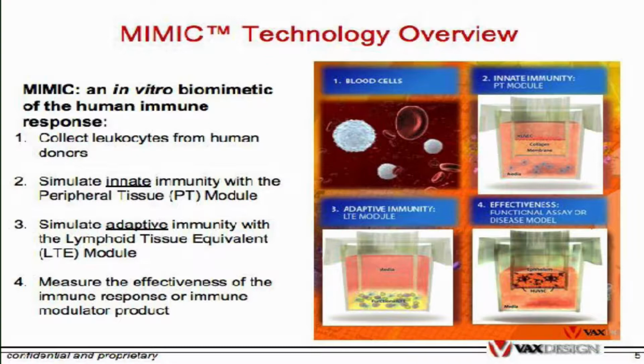We don't give them tea and a biscuit, unfortunately, but we do give them some monetary means to help with their donations. And so we leukophorese these people, and we get about 10 to 12 billion white blood cells, which are the immune cells, circulating immune cells in the body, and that's our donor system.